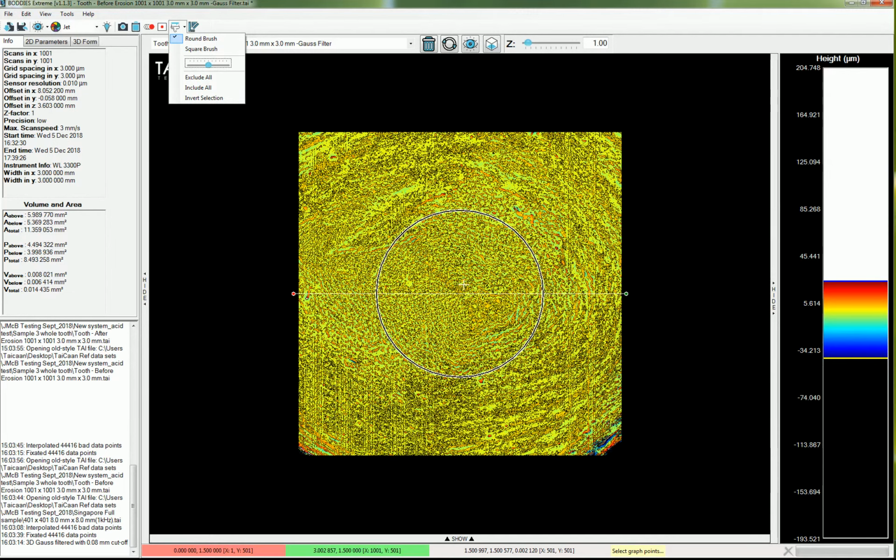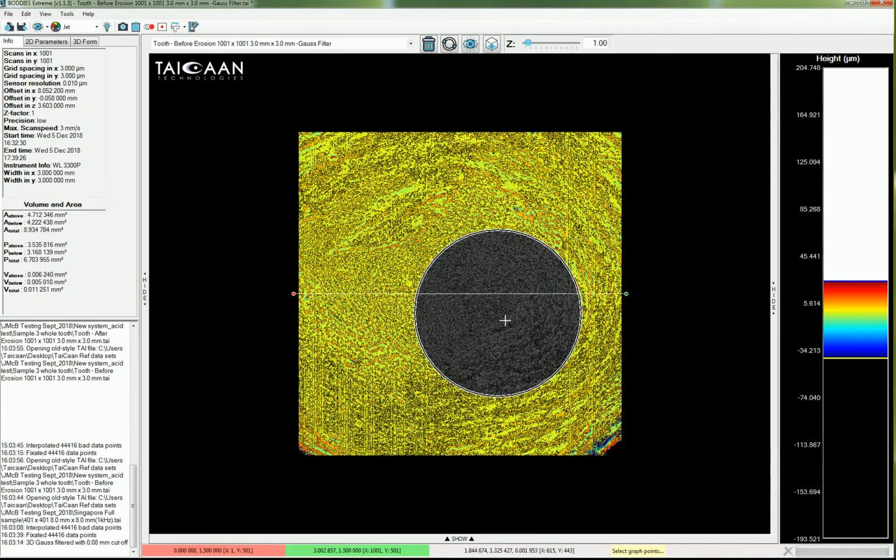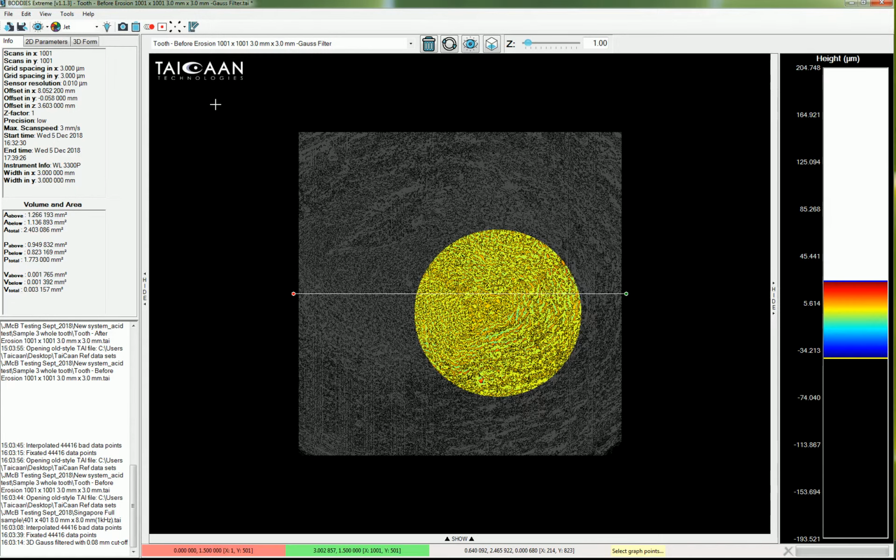have the region. And I'm just going to apply this region around the peak, and I've got the crosshair on the peak, so let's just remove that data. Well, actually, for the SA calculation, we need the inverse of this image. We need just this central region. So let's turn the brush off. Let's go back to the options here, and let's invert the selection. And there I've inverted the selection.